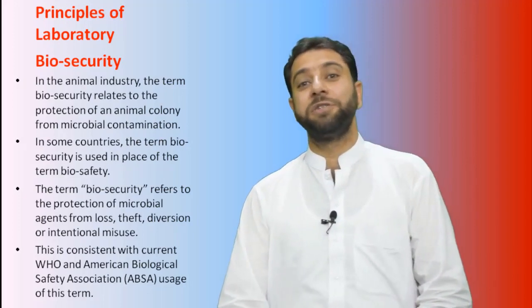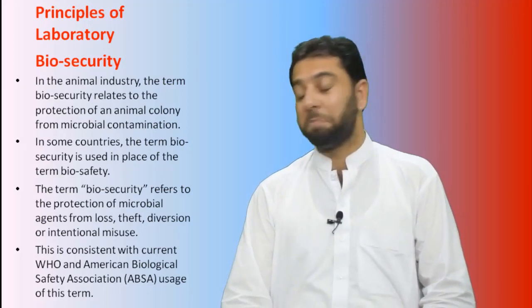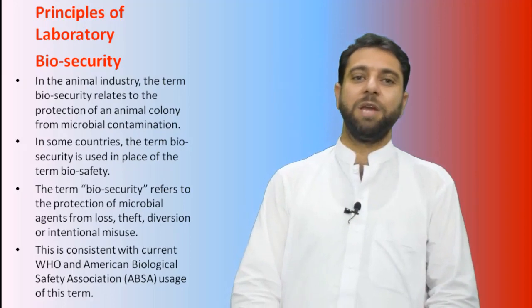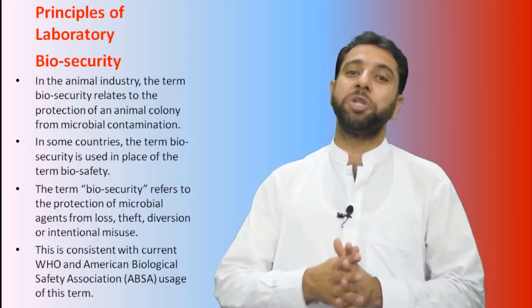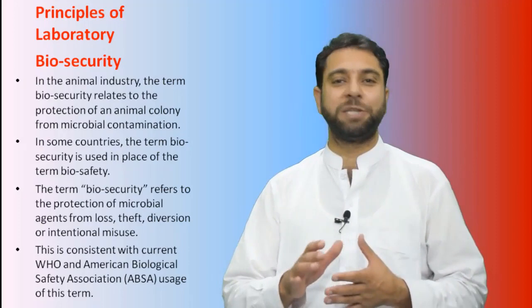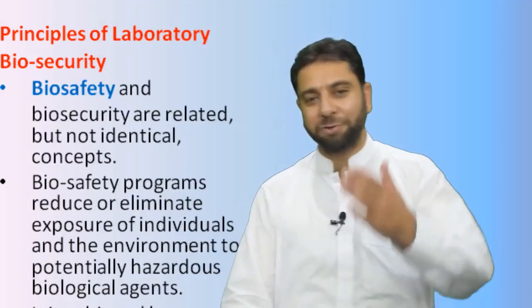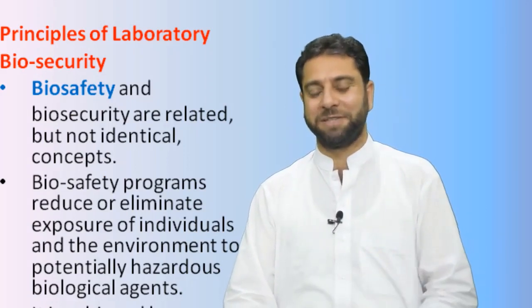In some countries, the term biosecurity is used in place of the term biosafety. We define biosecurity as the protection of microbial agents from loss, theft, diversion, or intentional misuse. So, biosafety and biosecurity are related but not identical concepts.